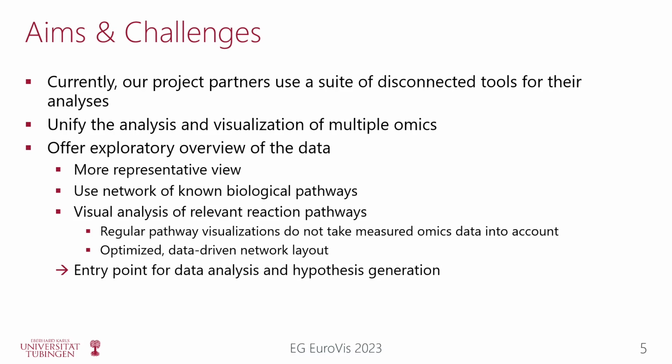Our main objective was thus to integrate those multiple omic analyses for visualization and visual analysis. We think that for a given experiment, this would result in a more representative picture for the actual processes in question. We also want to use known biological pathway representations to make use of existing mental maps and previous knowledge.